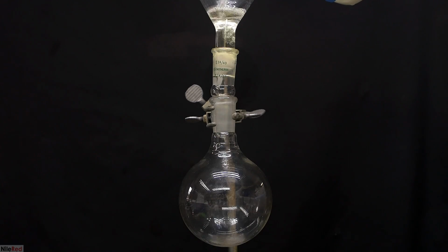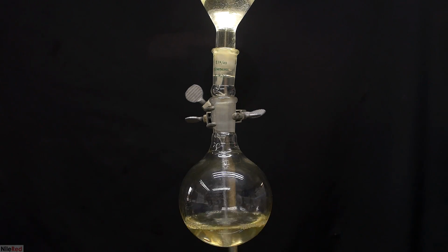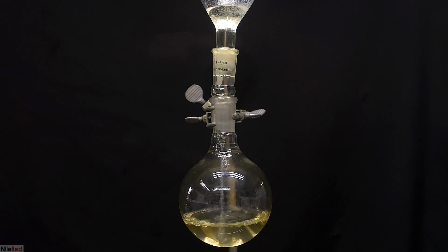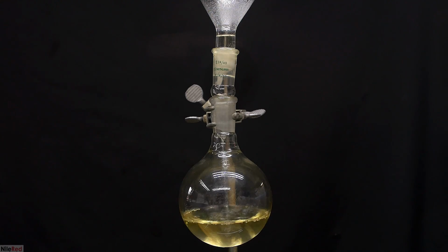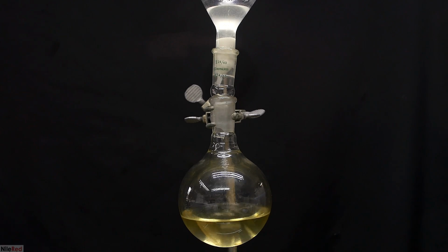The magnesium sulfate is separated from the ether solution by just filtering it through some cotton. The solution is filtered directly into a round bottom flask because the next thing that we're going to do is carry out a distillation to get rid of the solvent. After everything is filtered through, a small amount of ether is used to wash the flask as well as the funnel.